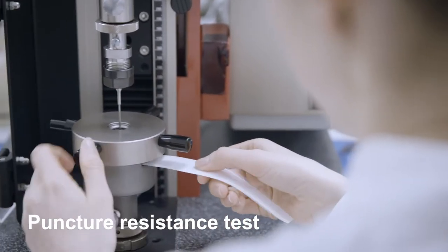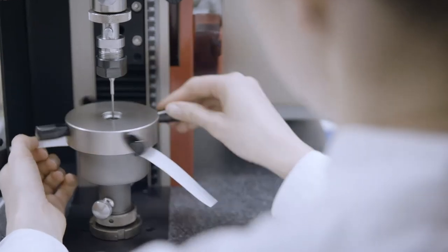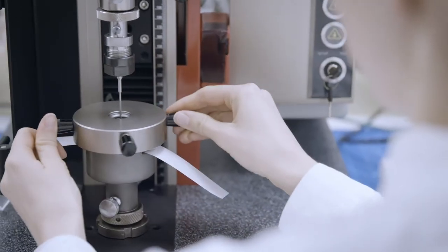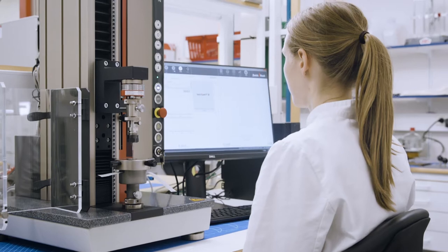Every day our experts perform quality control on 100 paper samples from our machines to guarantee our high standards and meet your expectations as a customer.